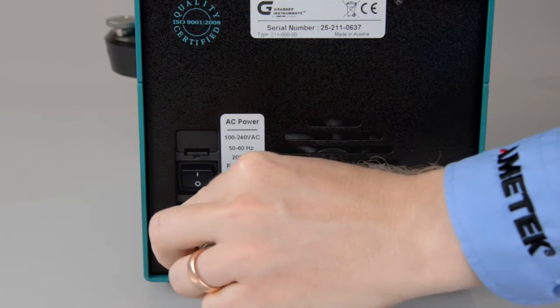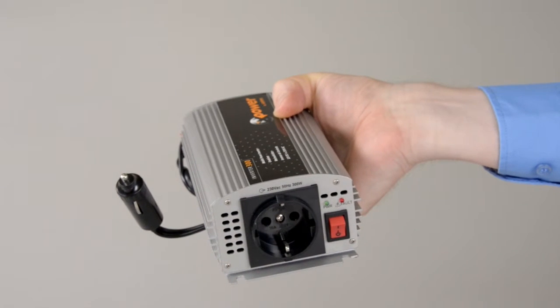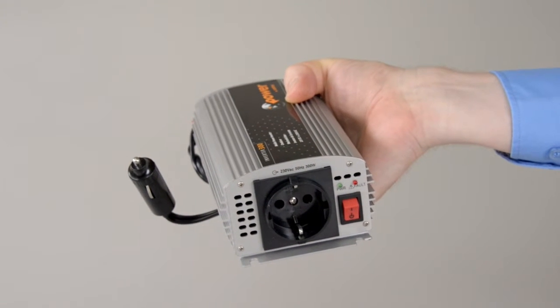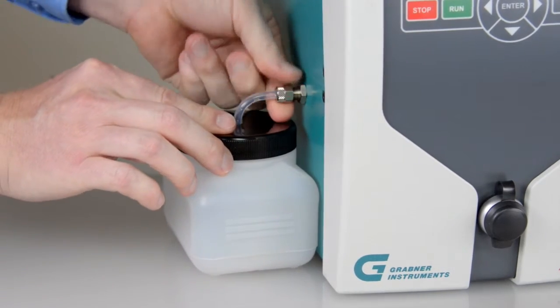Connect the power cable to the rear side of the instrument. If you connect to a vehicle battery, a 12-volt power converter is required. Connect the waste container on the left side of the VP Expert.